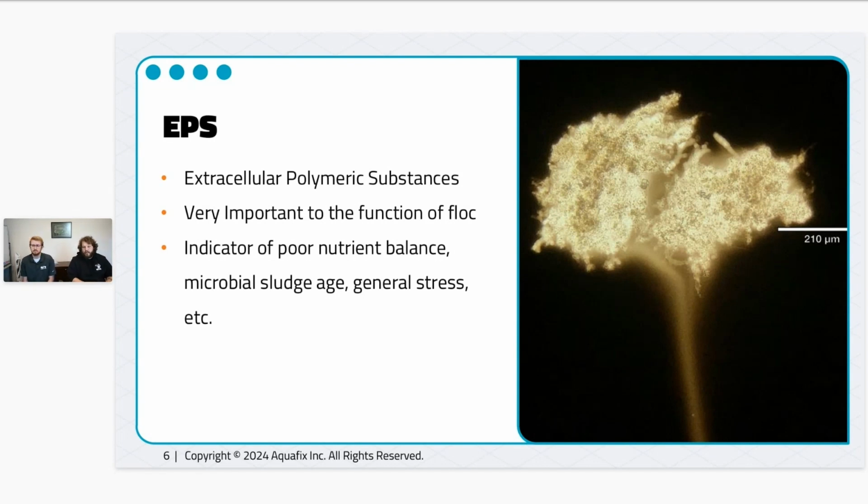Yeah. So when we look at sludge ages, I'm assuming you're talking about a microbial sludge age, which would be sort of like a sludge maturity. When we look at a young or an immature sludge, we're really imagining something that has a lot of free bacteria, loosely bound solids, some swimming ciliates, amoebas, things that are existing in a system when it's just starting to get going. And it would be possible to have low EPS in that kind of system.